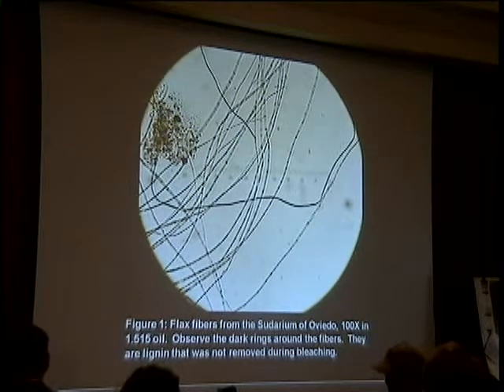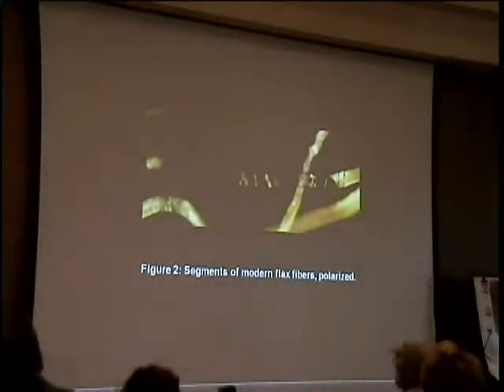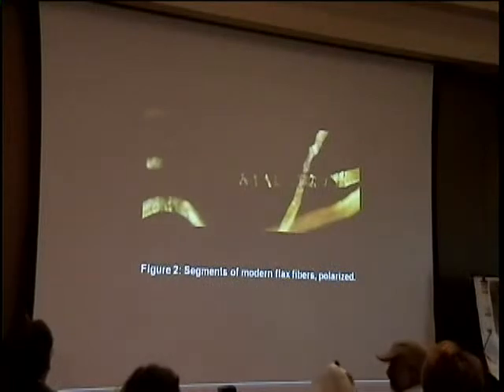Anything that can rupture the bonds in the structure will cause a defect in the crystal, and defects change the way polarized light travels through a crystal. The defects can be seen with a polarizing microscope. Figure 2 shows some modern flax fibers between crossed polarizers. Parts of the fibers lie at an angle to the plane of polarization, and they show bright birefringence. A horizontal length in the middle of the view is parallel to a plane of polarization, and it is dark.